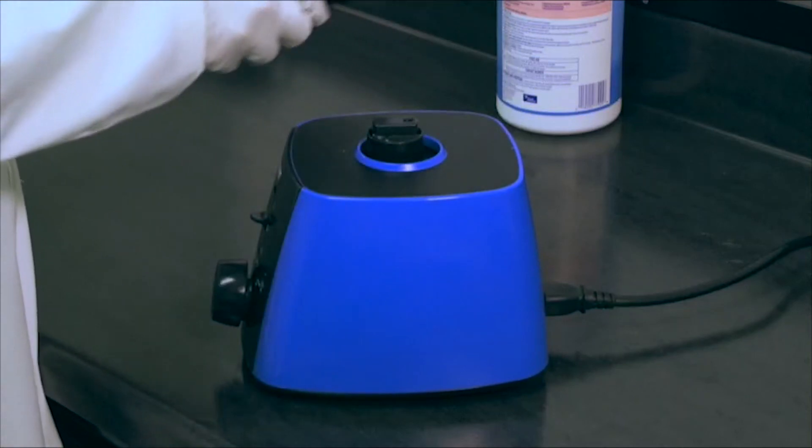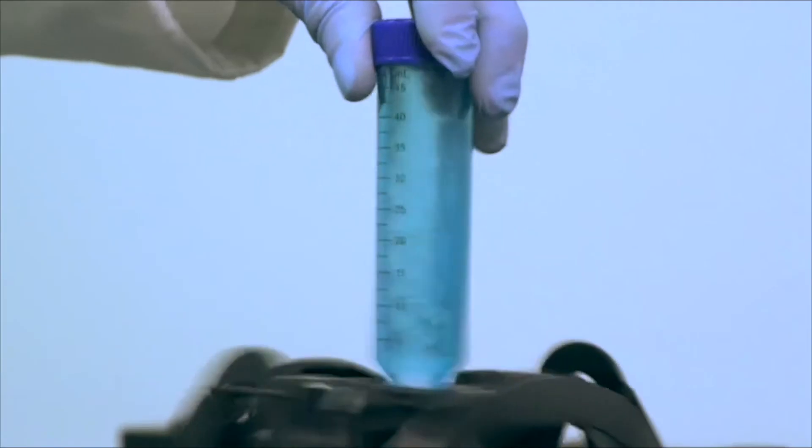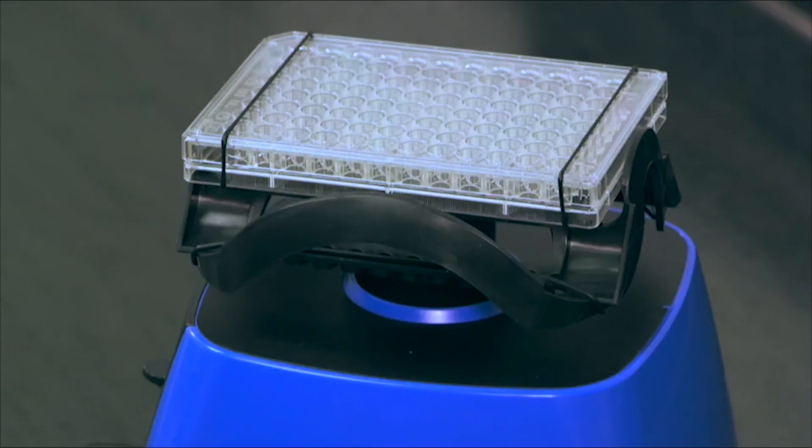And when the job is finished, the mixing head can be easily removed for cleaning. This functionally designed mixing head increases productivity and reduces cost as well.